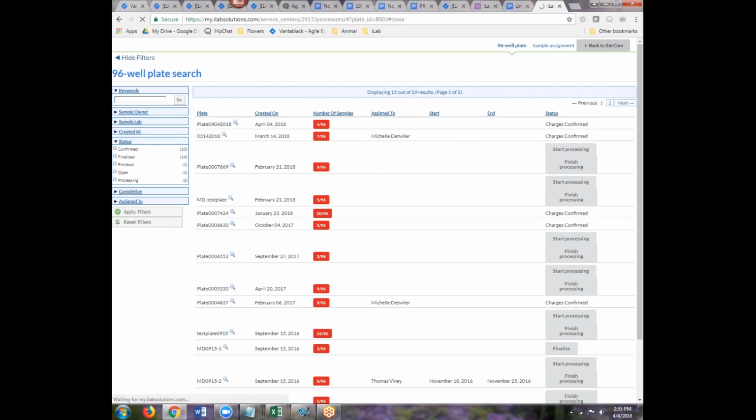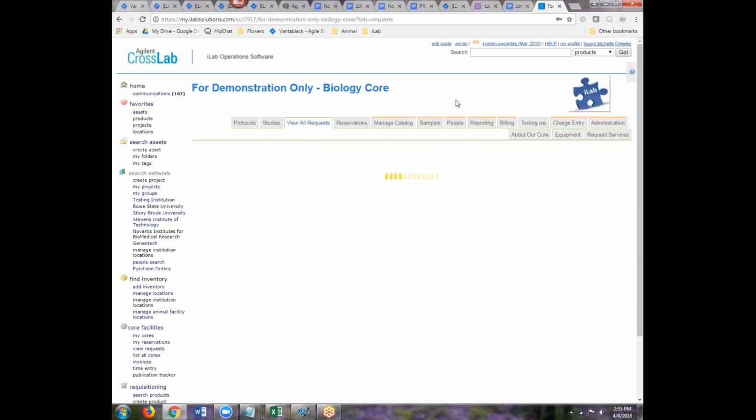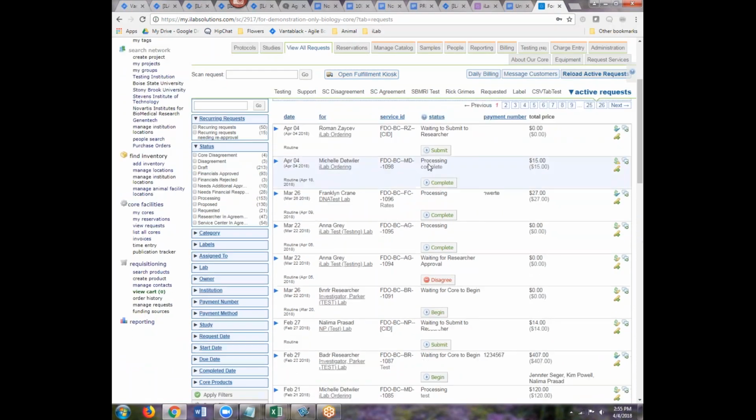So if we just go back to the core main page and look at our View All Requests page, you can see here's the order that I just placed. It has a status of complete.